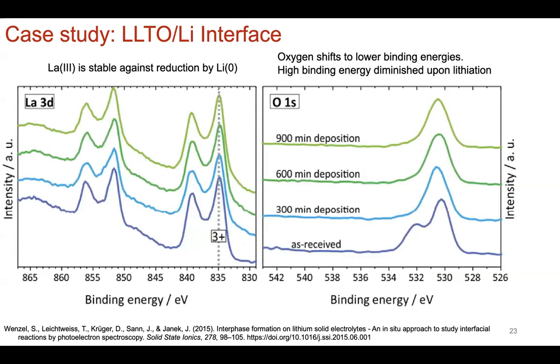increasing. Now, the role of oxygen and lanthanum, interestingly, what you see is lanthanum 3+ is actually stable against reduction. So you don't see formation really of the +2 state or even lanthanum metal. So what's really happening is the titanium is being etched out of the LLTO.